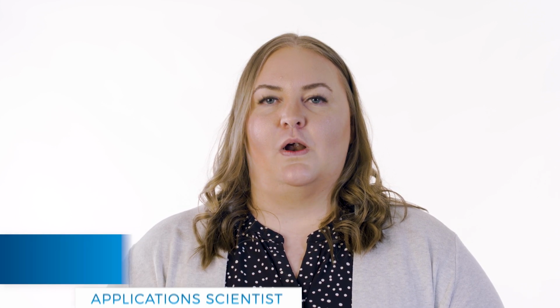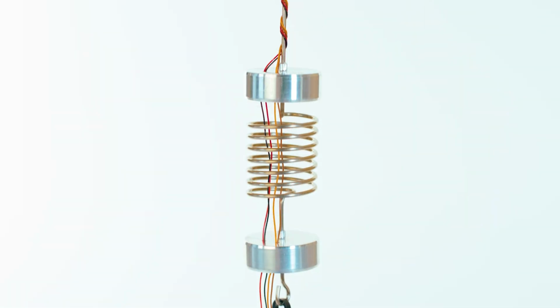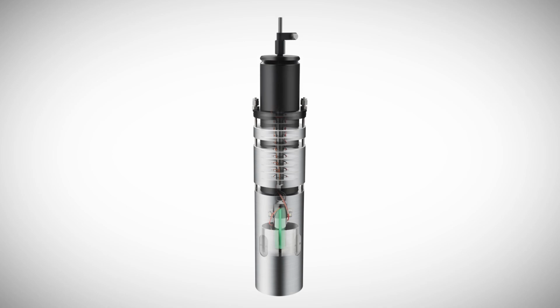In this Tech Tip, we will demonstrate how to set up the TAM IV to optimize baseline performance when large ambient temperature fluctuations are present. The Macrocalorimeter with an accessible reference and the 20 ml Mini-calorimeter with a fixed reference have a stacked design, meaning the reference sits below the sample measuring cup.